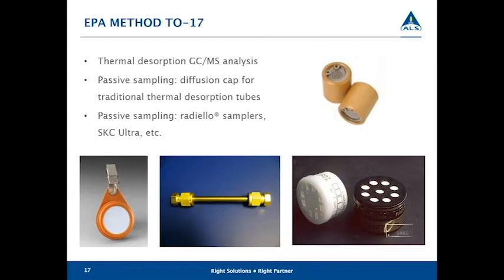If you have 5 or 10 cans that you need in a pinch, we can usually provide them in 1 or 2 days. If you need 50, that's not going to be possible. So we can provide them quicker, but it depends on the size of the order. And also, I'll add to that whether or not you want batch certification or individual certification, because the individually certified cans take longer to produce. And Charlie did specify, he said it's usually 5 or so.